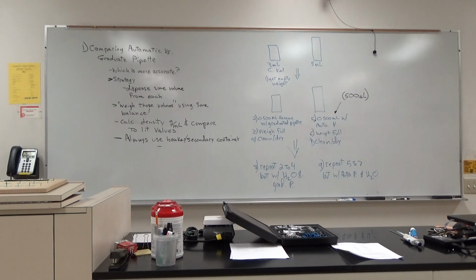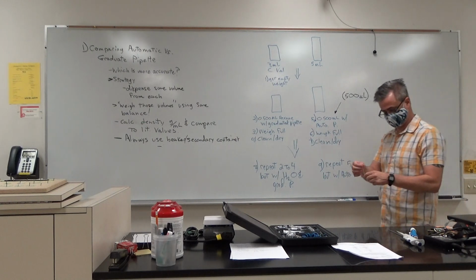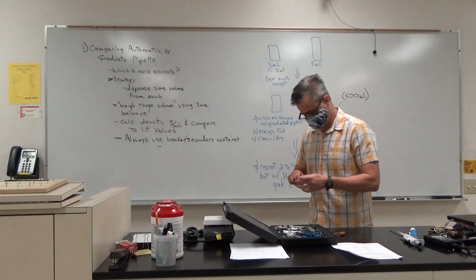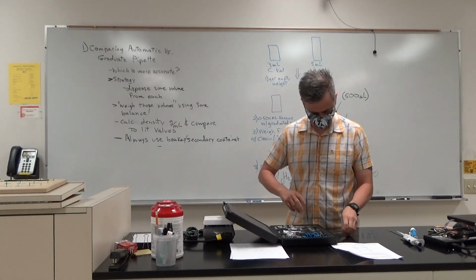While we're on the subject of pipettes, I just want to finish one more thought. There used to be another part to this lab that we don't do anymore. It was calibrating these disposable pipettes, and I didn't feel it was worth the time that we spent on it.